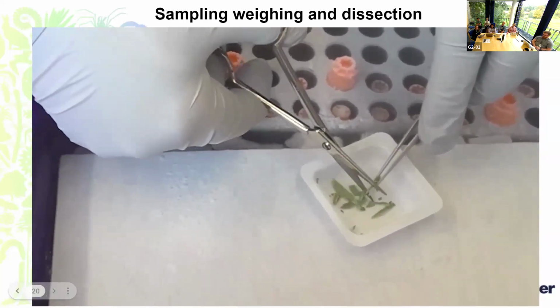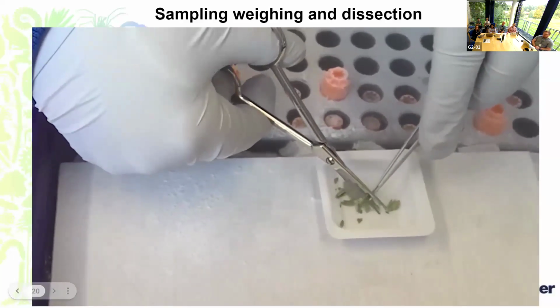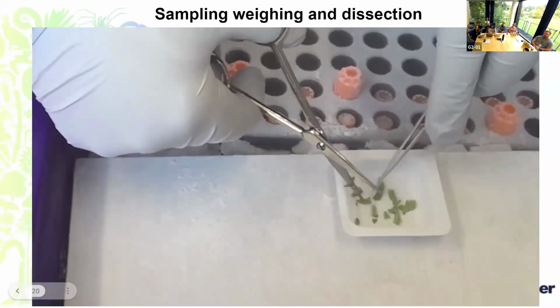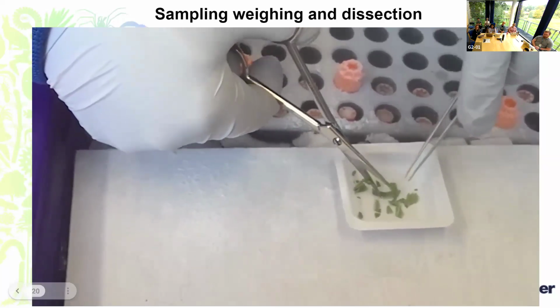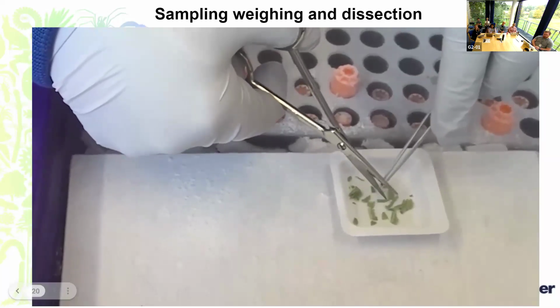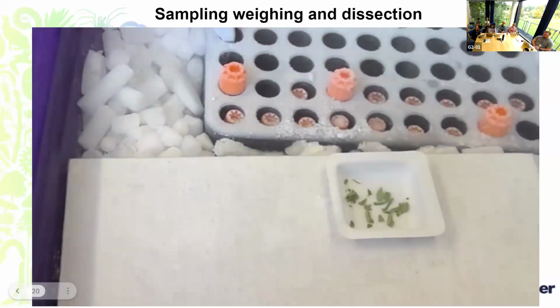So we do optimize the bead beating steps for different taxons, as well as Liz would carry over with the entire bead beating process. She'll explain a bit more how corals are bead beaten and how they differ from plants, and we change the impact level and the time it gets bead beaten, and the different types of beads that we use for different taxon groups.